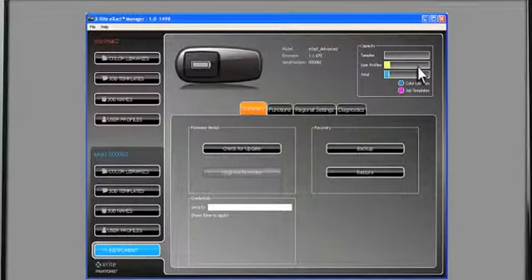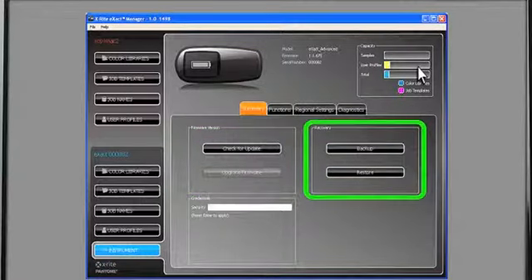To the right, you'll find the instrument's memory capacity. This shows how much of your memory is used by your color libraries, job templates, samples, and user profiles. Under the Summary tab, you'll find more options. You can check for firmware updates and update the existing firmware if any are found. You also have the options to back up and restore your device settings and libraries.